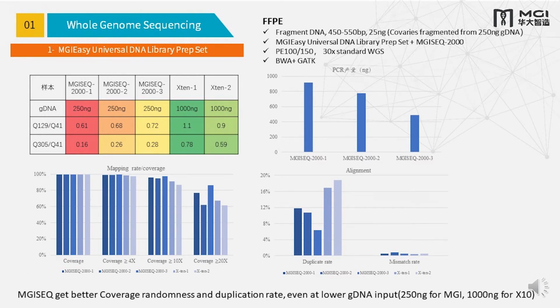Usually, we want these two values to be more than 0.4. Samples above 0.4 refer to class A DNA quality for FFPE samples. I guess some of you have already seen some FFPE samples. We have different quality standards, grades, for the DNA quality. If the DNA is highly degraded, the data will not be good. Sometimes that cannot be avoided because of the biological samples.